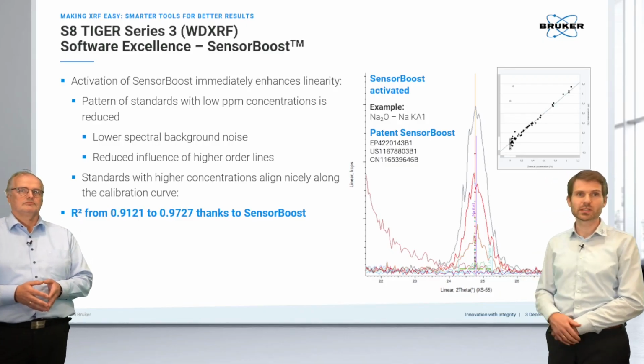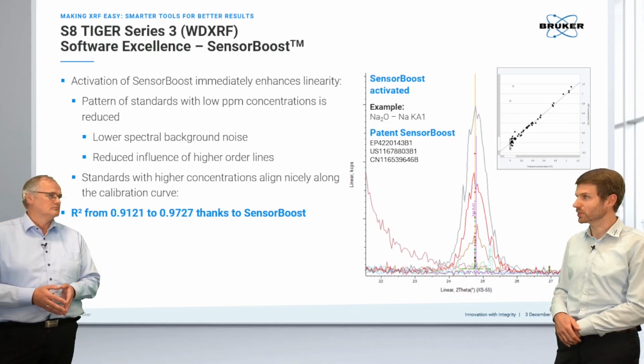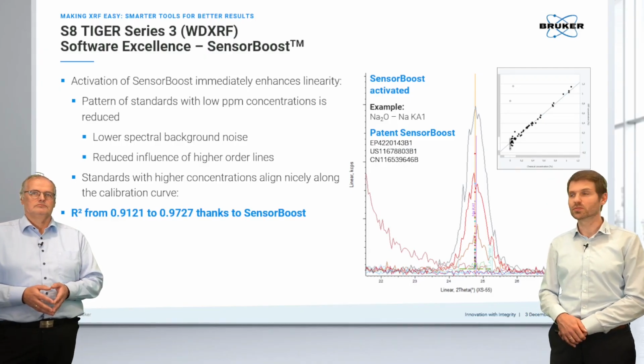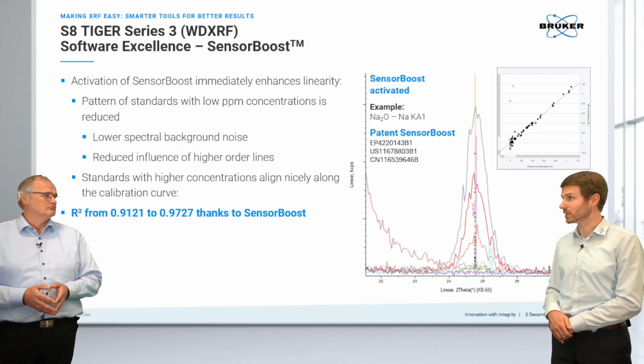Yeah, and those familiar with correlation factors, especially for broad calibrations, and this is for refractory materials here, which can be relatively challenging, know that this is a huge improvement, and this, to be honest, simply by clicking a button in the software.